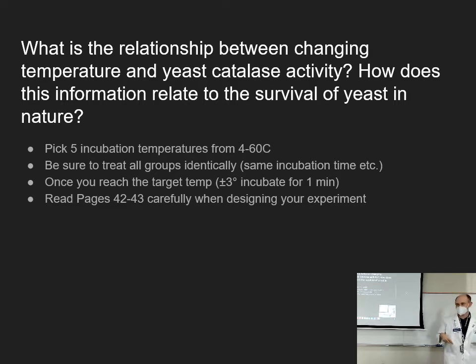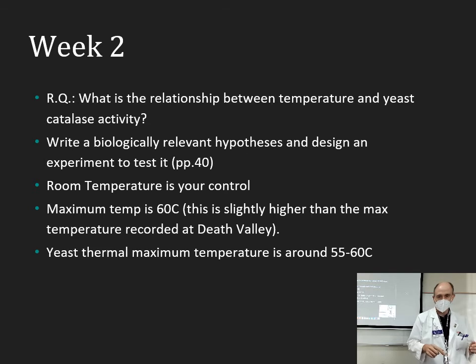So you're going to have a thermometer in one of them to watch it. Okay? We'll talk about that a bit more. So let me just walk you through here.